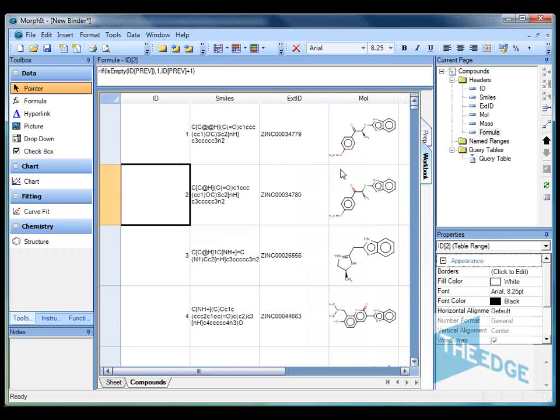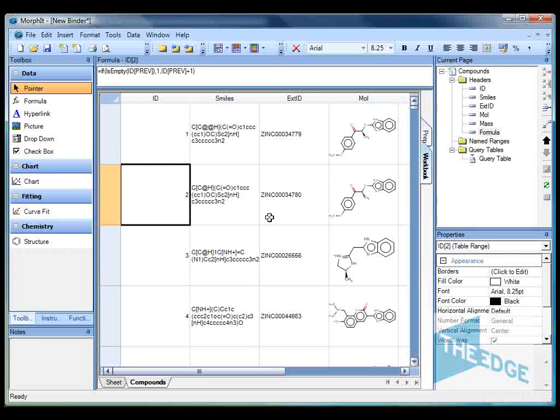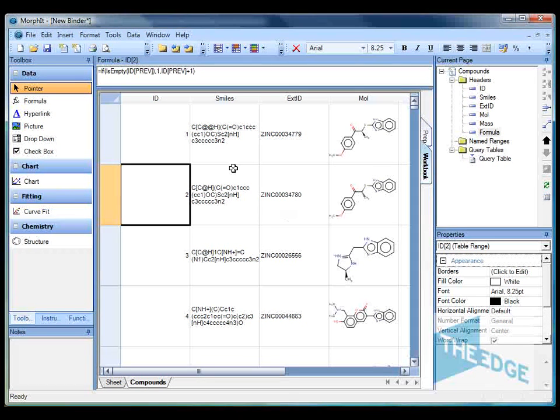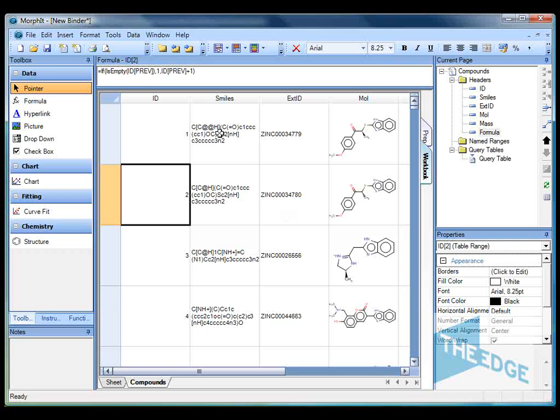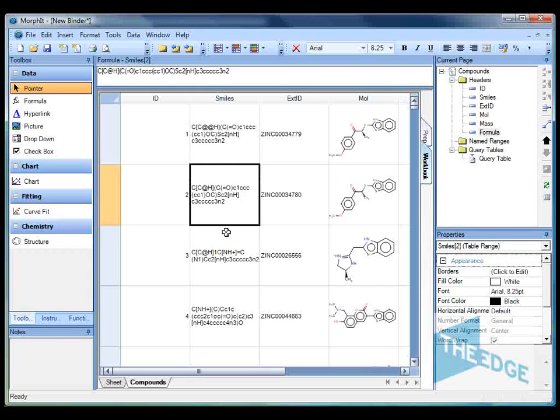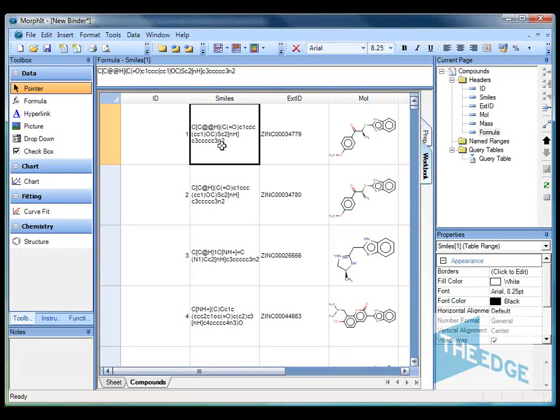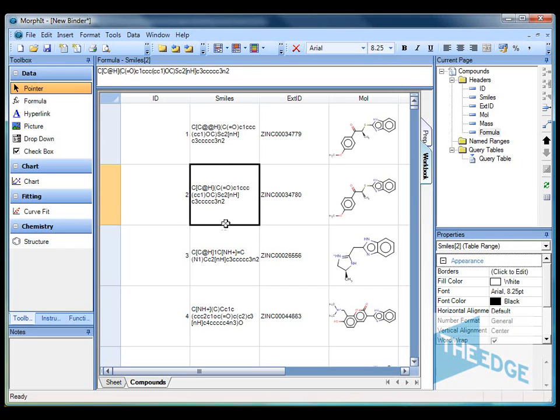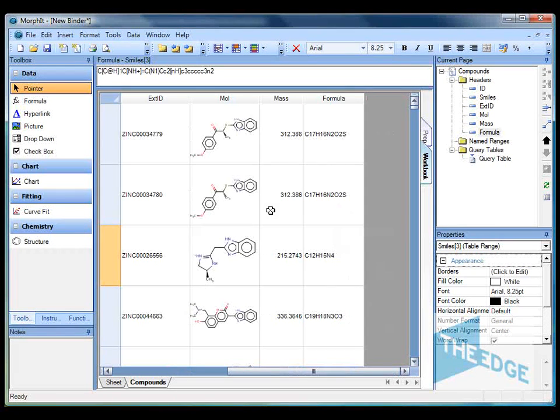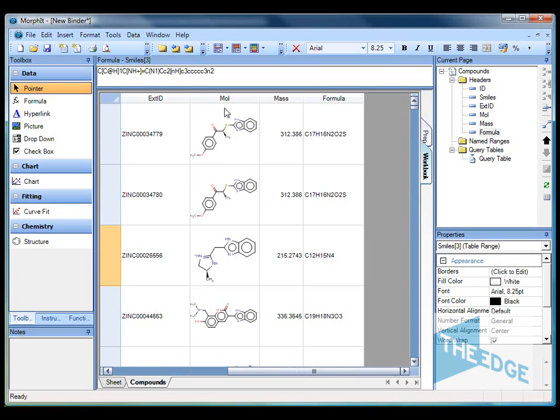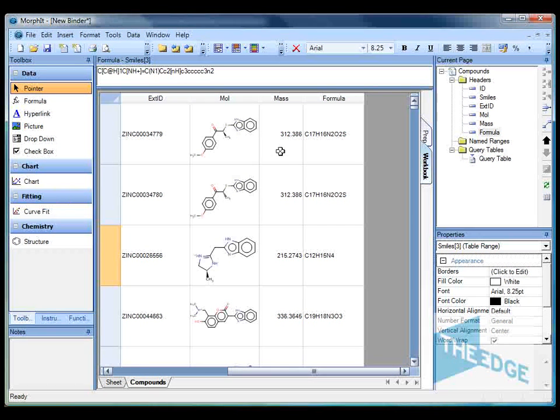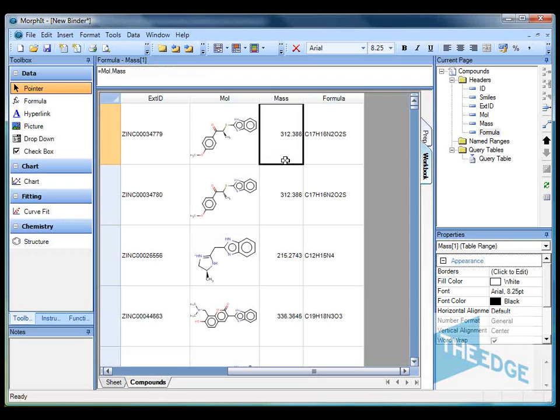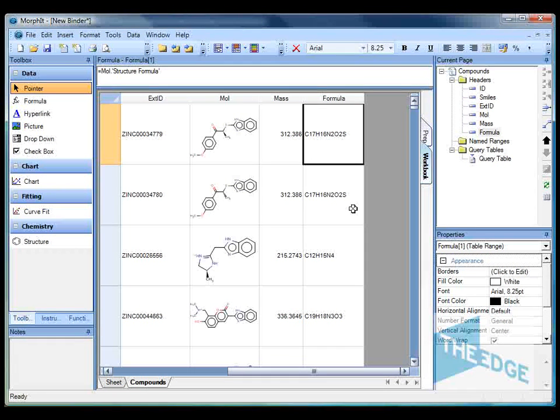So all we've shown here is how to import data from flat files into the Morphit environment. We've then transformed the chemical format structures. In this case stored as smiles codes but it also works from embedded mole files. And then to generate the molecular graph in a high quality rendering within the mole column. And then to use the structures column in order to calculate average molecular mass and the molecular formula.